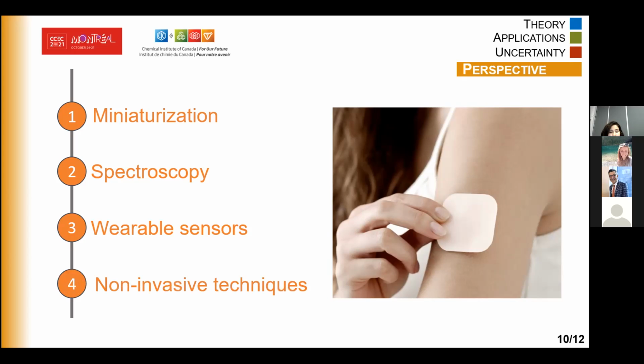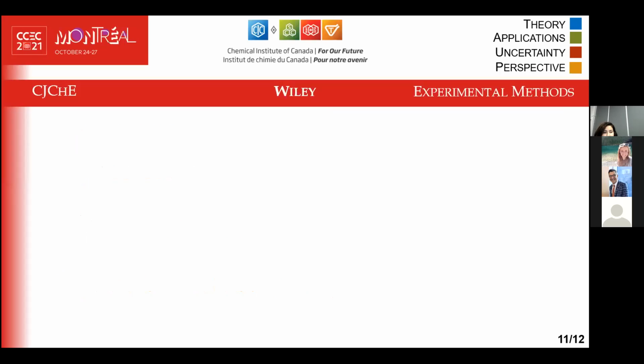And also, there is a need to upgrade from invasive techniques to non-invasive techniques. For example, in cell culture or biomedical applications, or in microreactors where the existence of a pH meter alters the conditions in the reactor, it is necessary to develop non-invasive techniques.